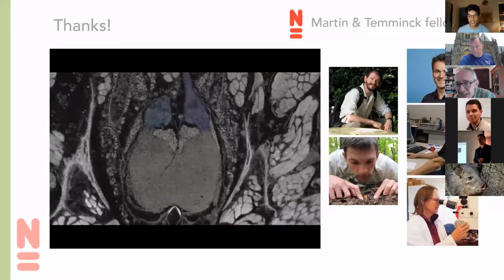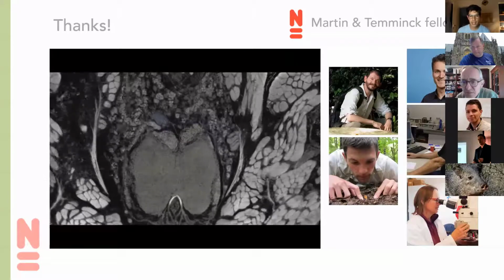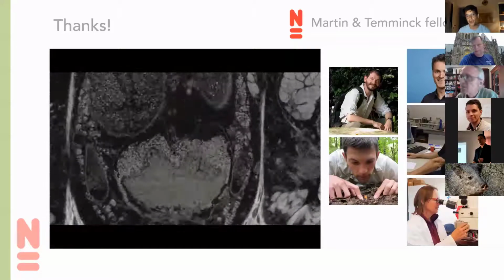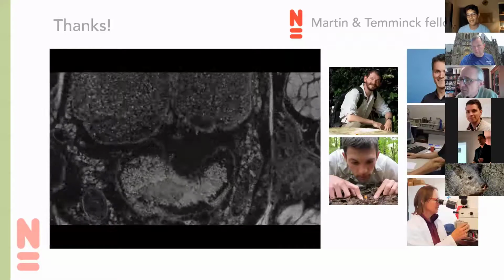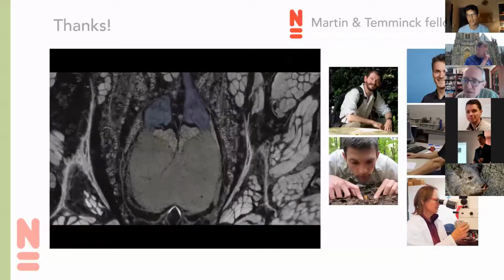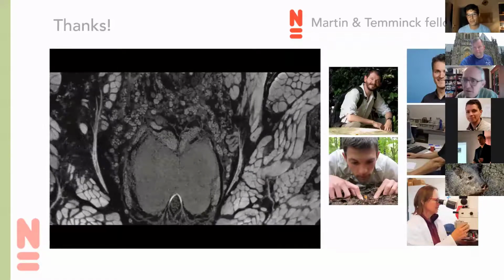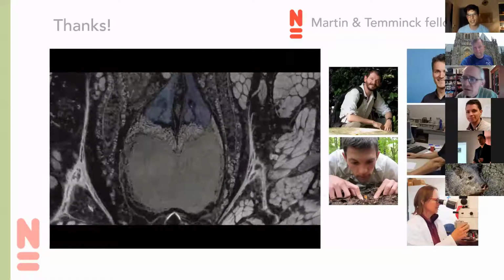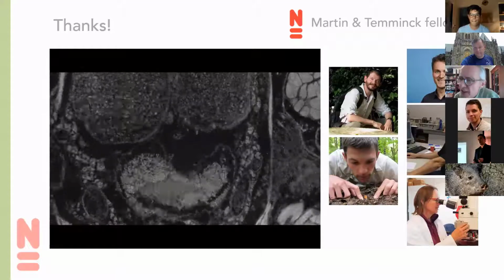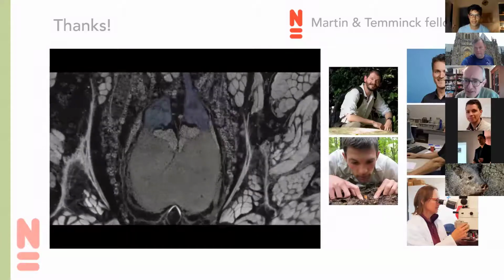Yeah, we didn't use the Lugol solution. Yeah, that might have been a problem from our protocol. But although the level of shrinking that we had is a bit higher than what is reported in literature, still, if we avoid that step of drying the specimens, we can completely avoid the shrinking whatsoever. So, yeah. Yes, great. And then Brian Patrick just wants you to explain, how does critical point drying introduce artifacts?